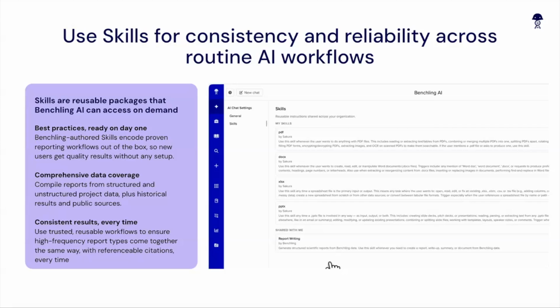Benchling's already provided a number of these for you, so feel free to test out any of these when you're trying to build out reports, and use them as frameworks for any other skills you want to build. So as you spot any kind of repeatable tasks that take a lot of time that seem worth automating, go ahead and try your hand at building some of your own.